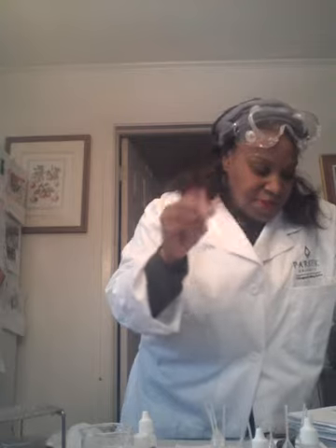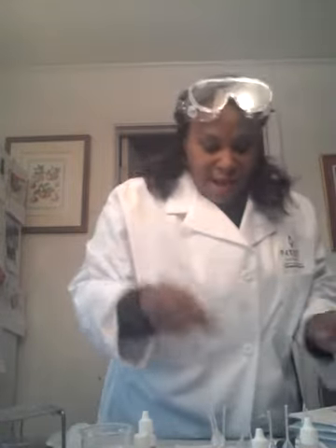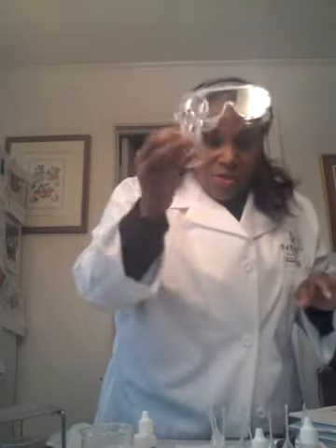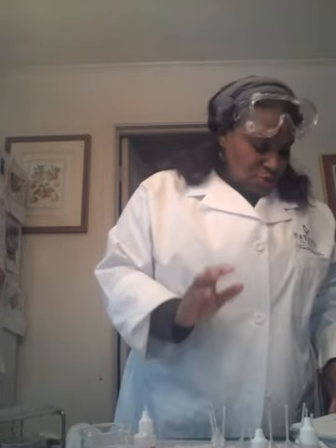And basically this would be the reaction of the presence of the silver nitrate, and the results of the precipitation will also be recorded. On our little section here, for the most part, I have my little magnifying glass. As I said before, I have problems with seeing very well, so I will be using this. And doing all of the actual tests, I will be timing them so that I can make sure that I give it enough time to do the reaction.